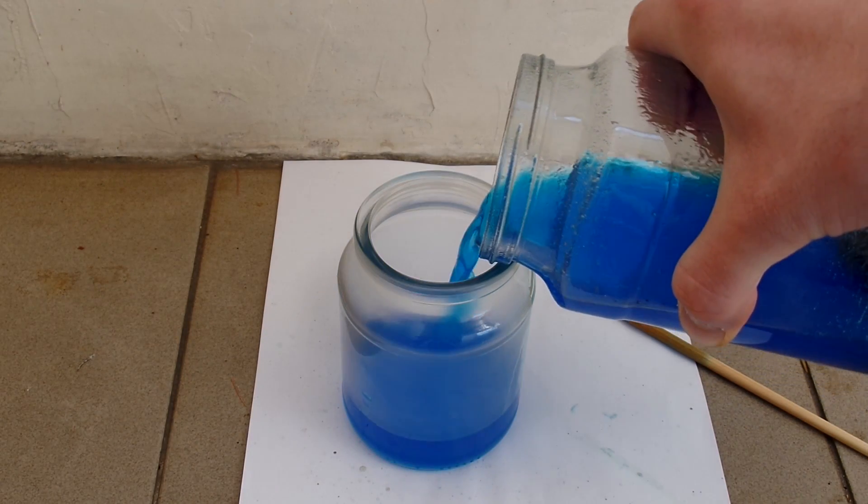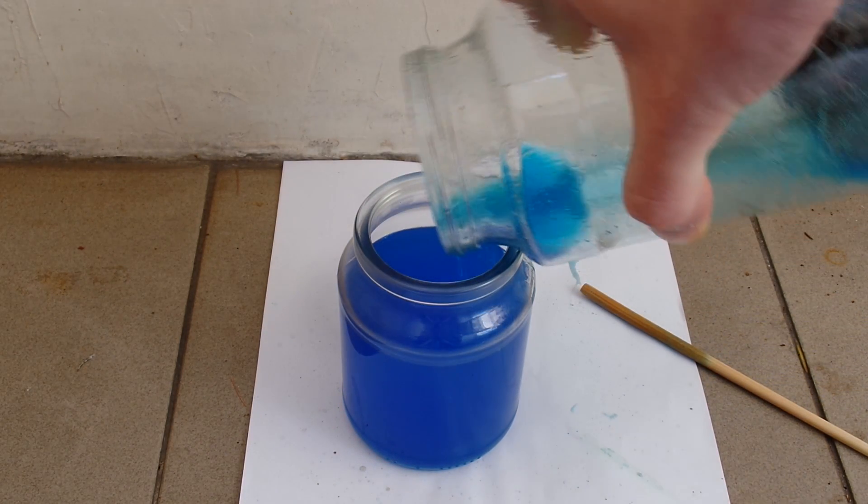After about 20 minutes, I pour off the copper salt solution and add more water and acid mix to the copper to dissolve some more.